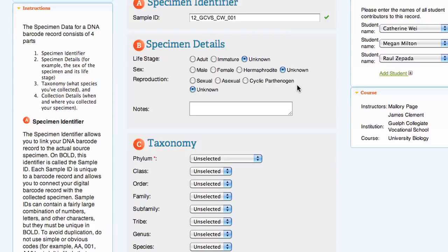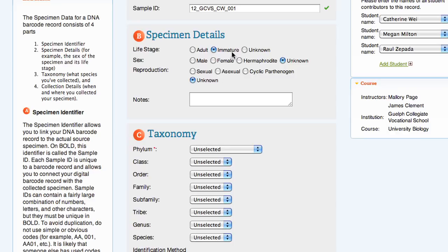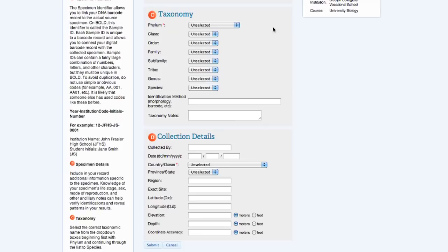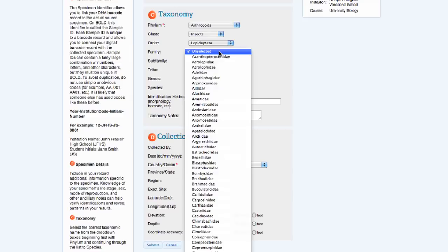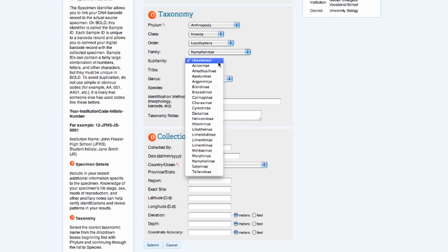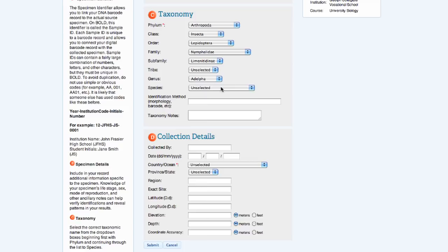The next stage is to fill out the specimen details, such as life stage, sex, reproduction, as well as any notes about the specimen. The taxonomy section contains drop-down boxes for all the major taxonomic divisions between phylum and species. Once students have selected a higher taxon, the drop-down boxes below it will be populated. For example, students can't fill out the order Lepidoptera until they've selected the phylum Arthropoda and the class Insecta. There's also a section to enter the identification method, such as morphology or barcode identification, as well as any taxonomy notes.